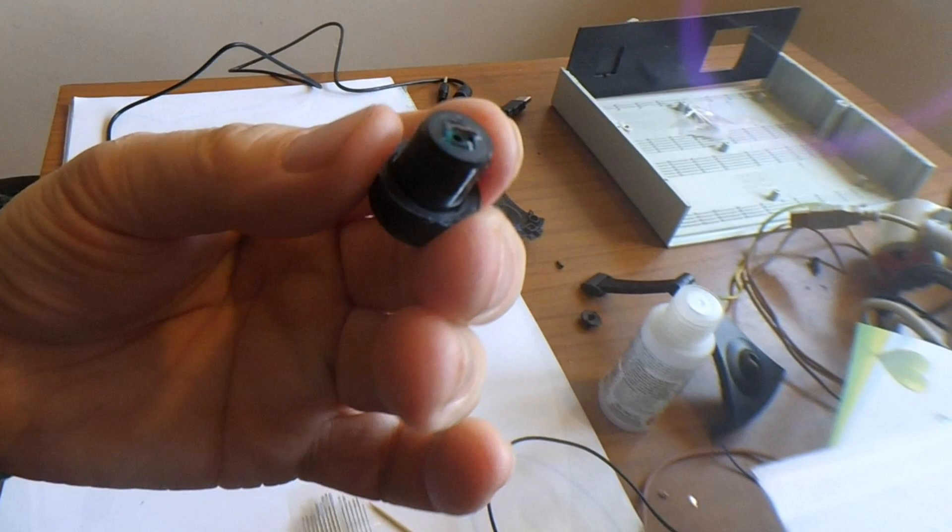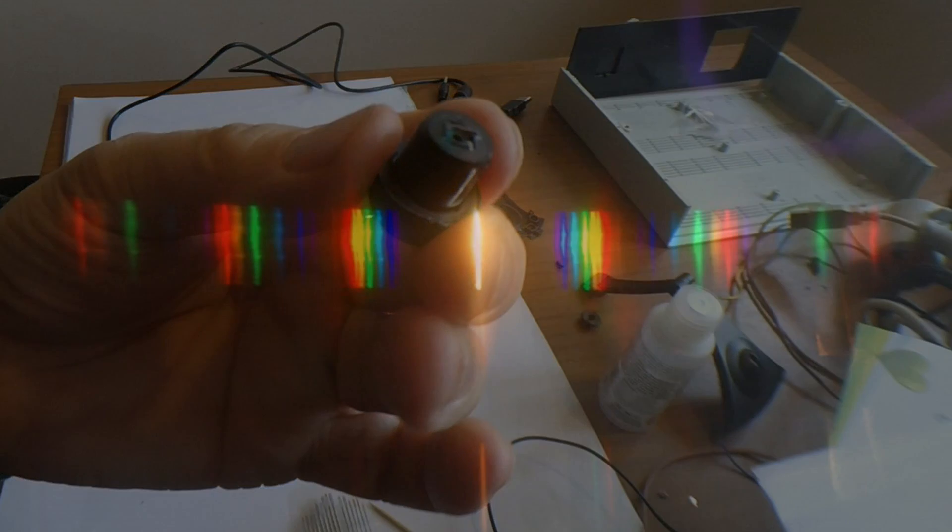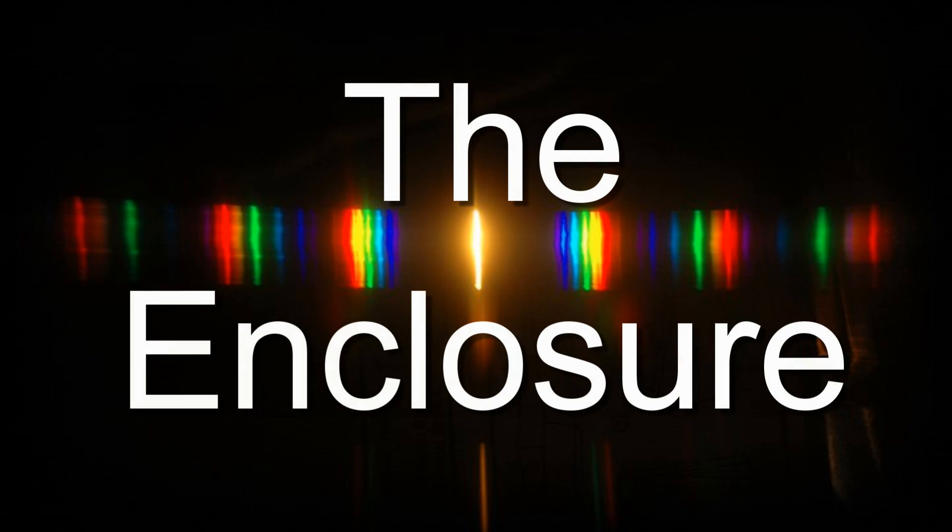Okay, we're done with the camera. We've taken it out of the case, and we've removed the infrared filter from the back of the lens. So we're ready to start building the rest of the project.